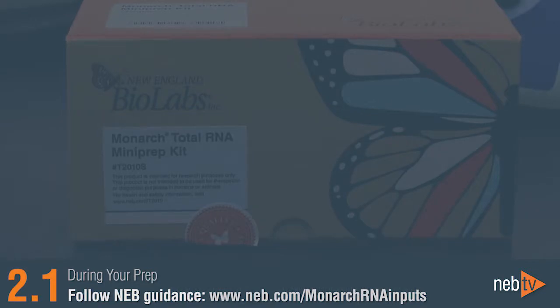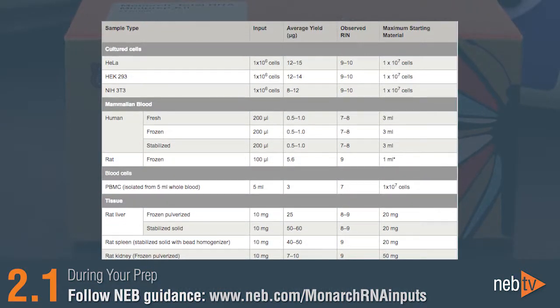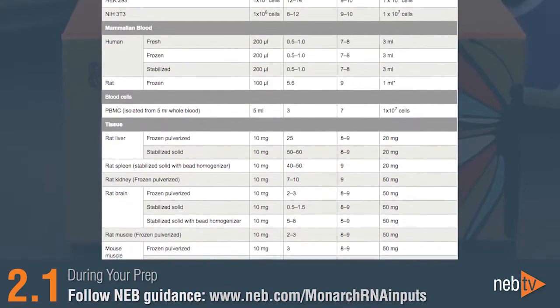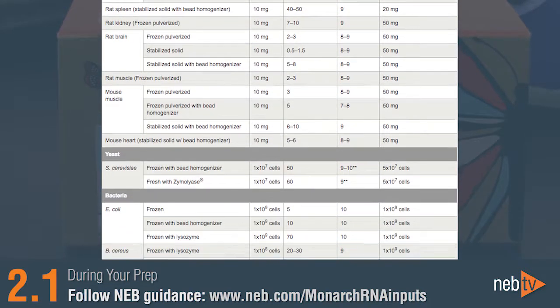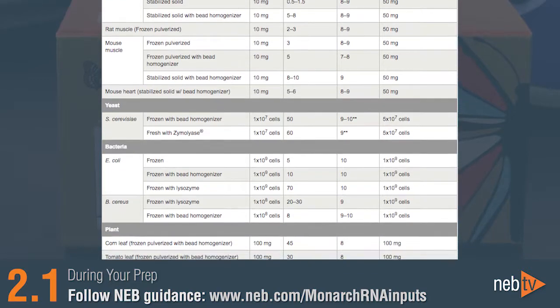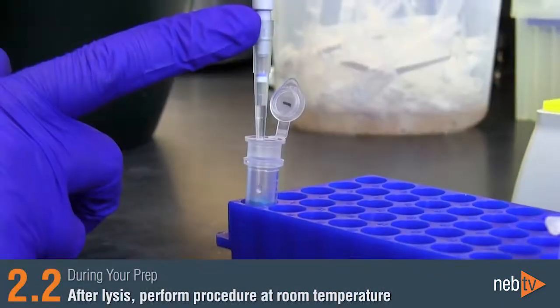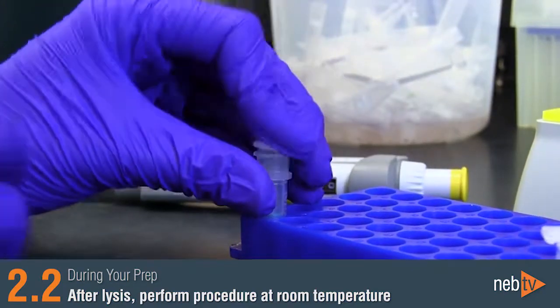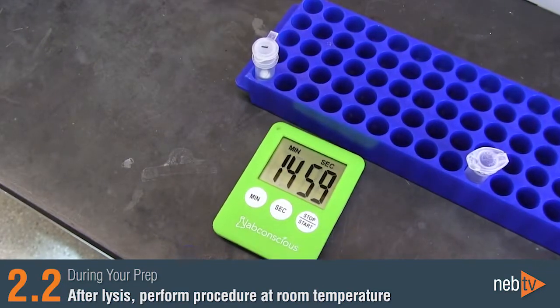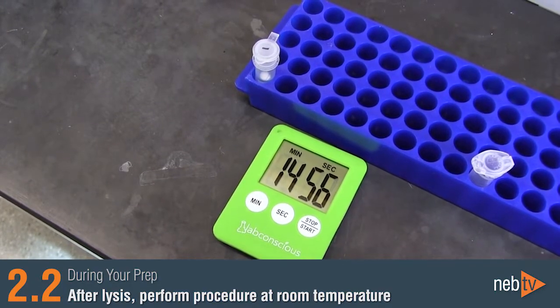Be sure to follow our guidance on the recommended sample input amounts in order to ensure that the buffer volumes are appropriate and that the columns are not overloaded. This is a common mistake that can quickly reduce yield, purity, and integrity of your RNA. After sample lysis, perform all steps at room temperature to prevent detergent from precipitating in the buffers. Do not place your samples on ice after lysis.